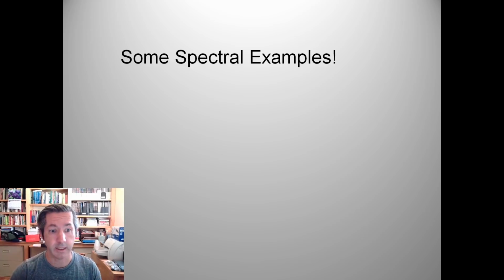Now let's tie things together. We've looked at IR, we've looked at mass spec, we looked at proton NMR and carbon NMR. Let's tie them together. We'll combine IR and both types of NMR spectroscopy in these examples, and I'll show you how you can go through these and actually get all the pieces of the puzzle and then put that puzzle together and get your structure. So let's take a look at an example here.